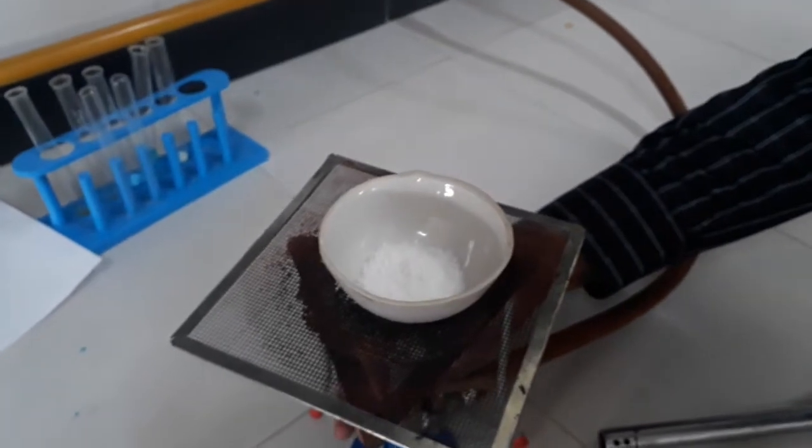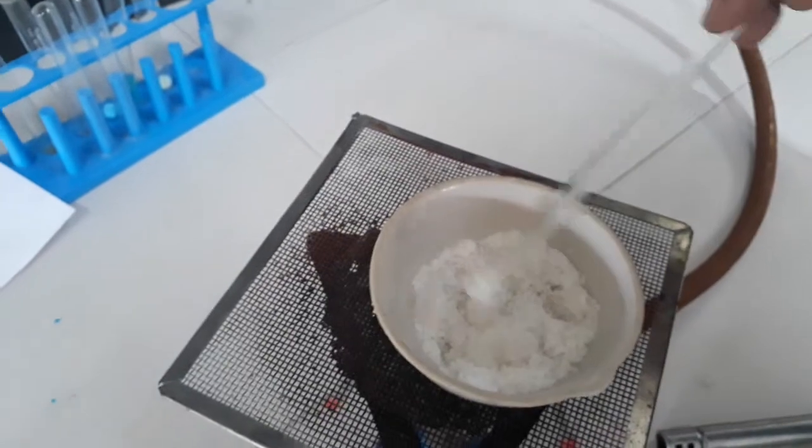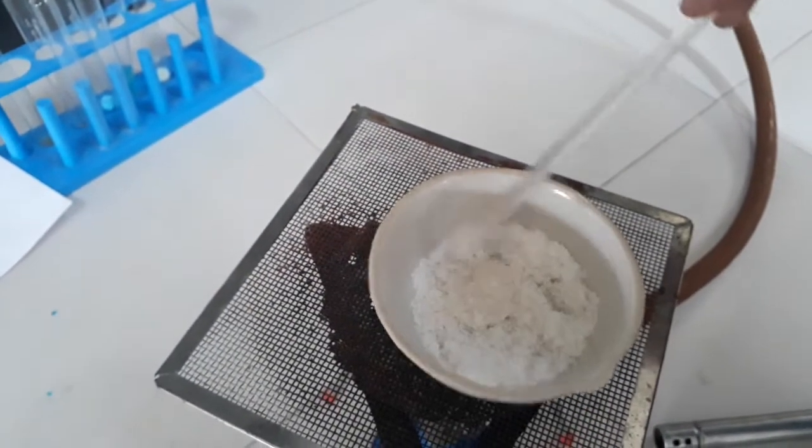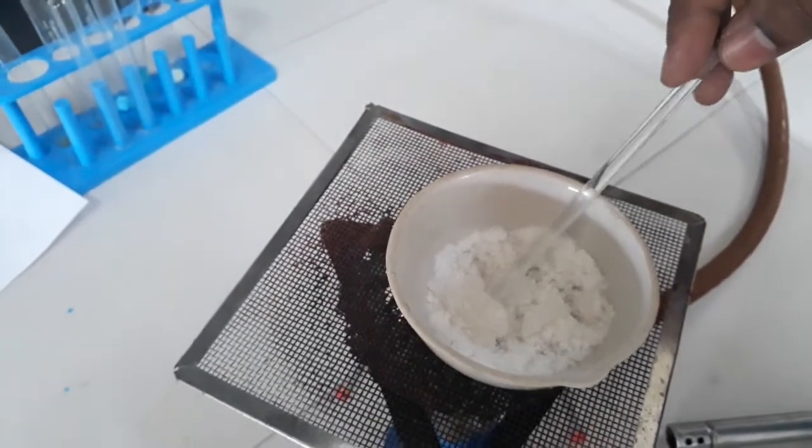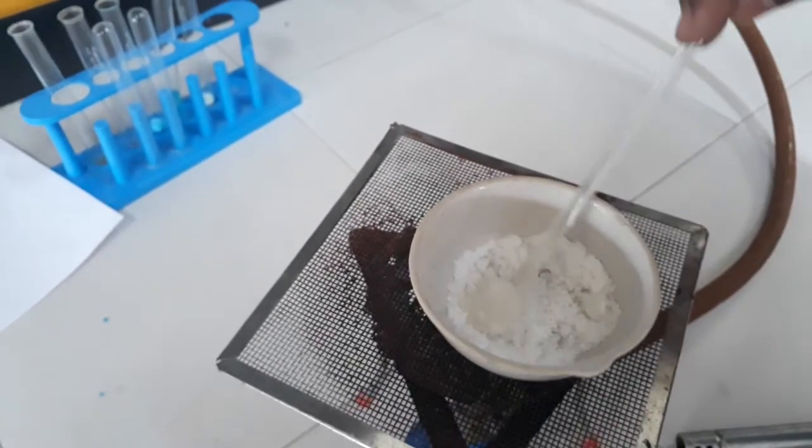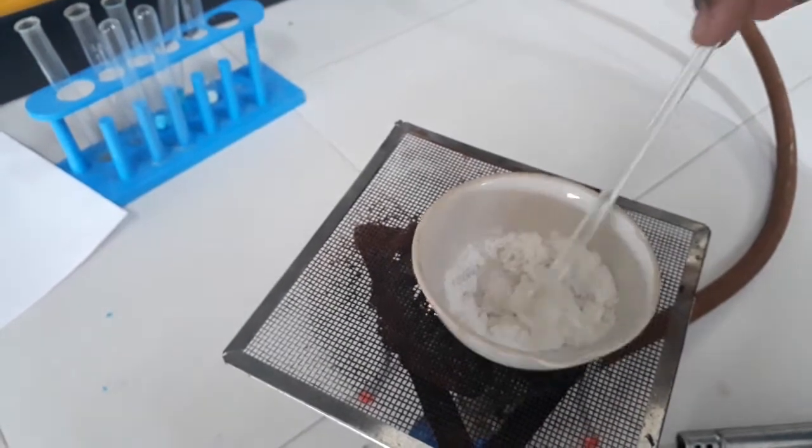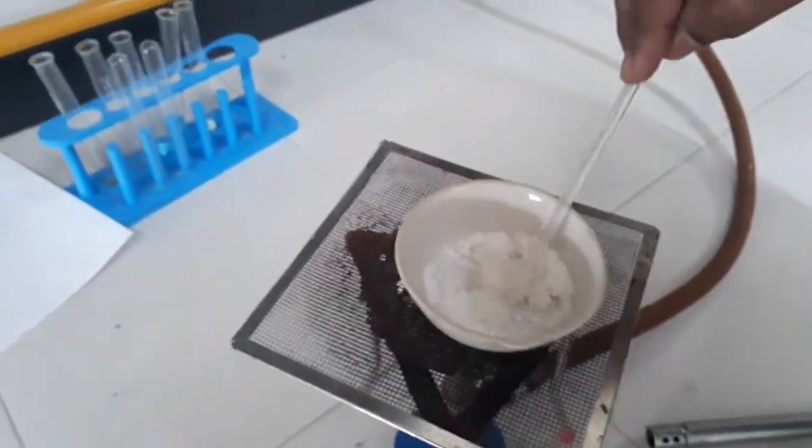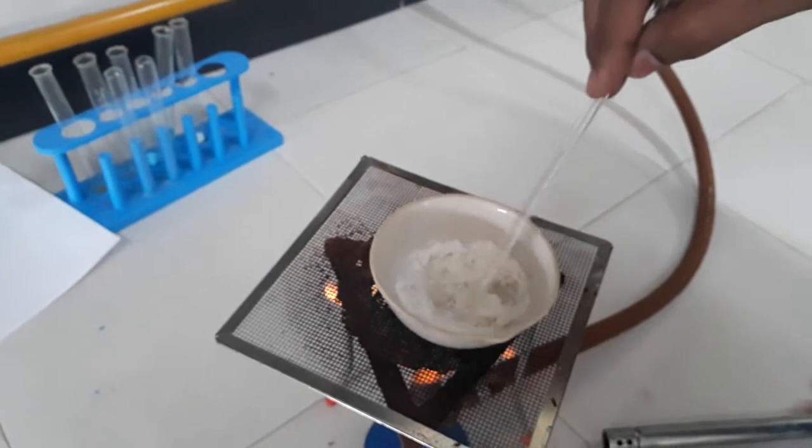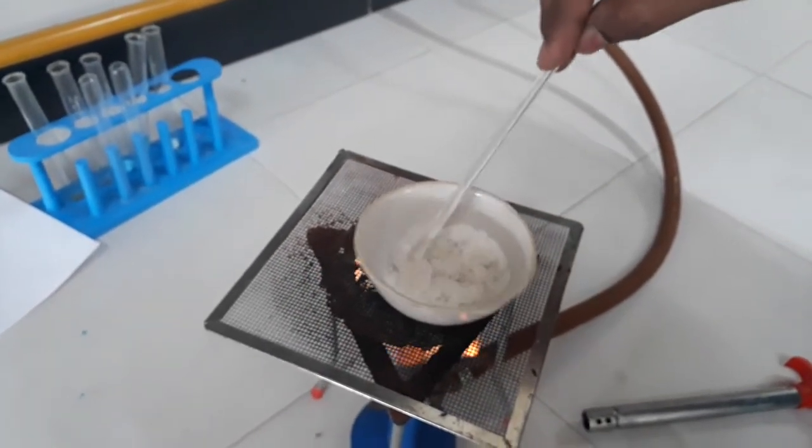Here you can see the melting process or water of crystallization has started to form. You can see puffed alum is formed. Puffed alum means swollen alum. When alum is containing water of crystallization, its volume will increase and that is known as puffed alum. During the heating process you can see due to water it has started to melt.